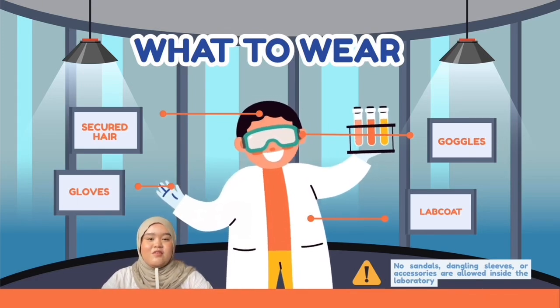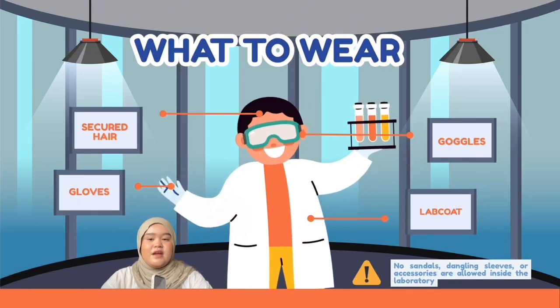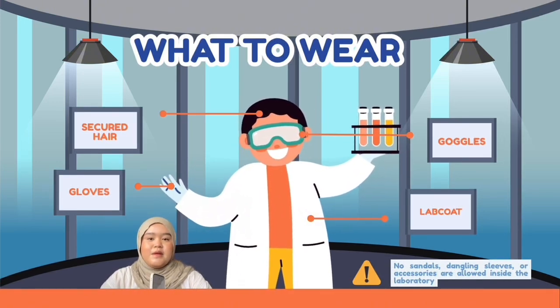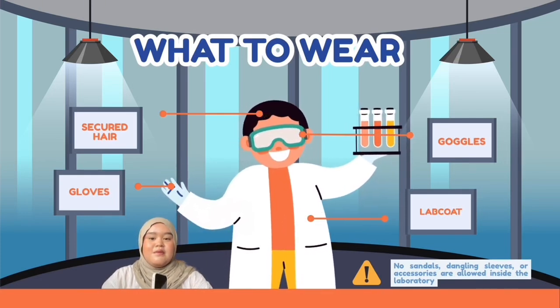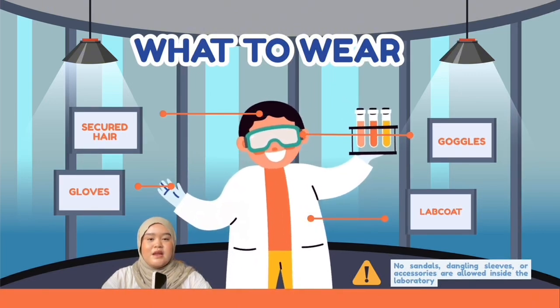PPE is the last line of defense in the hierarchy of control. Even when engineering and administrative controls are in place, PPE must still be worn correctly at all times. Wearing full PPE may seem simple, but it plays a very important role in preventing injuries and exposure in laboratory work.